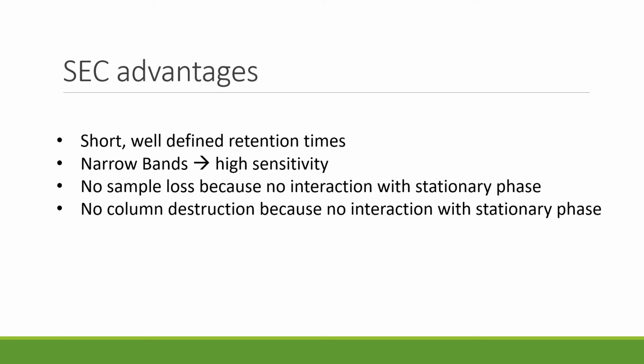So some of the advantages of SEC is that we can get relatively short, well-defined retention times. And these narrow bands usually equate to some high sensitivity. We also usually don't have any sample loss because of no interaction with the stationary phase.